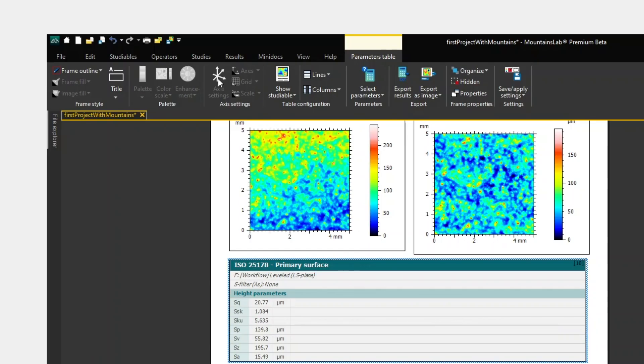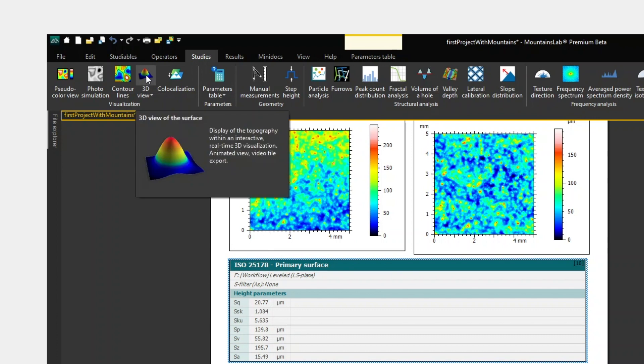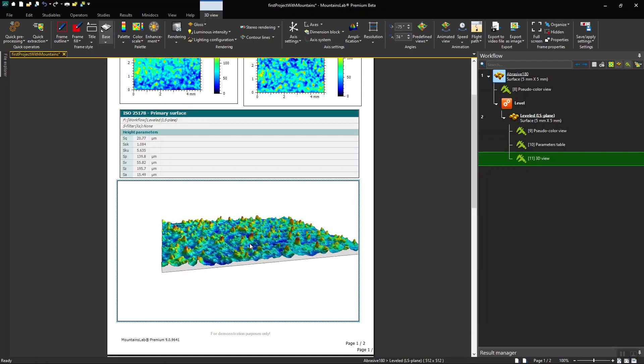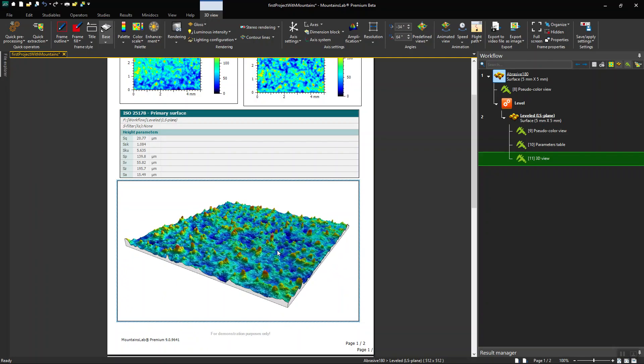in the Studies tab, I'm going to choose 3D view. The 3D representation is then generated in the document.